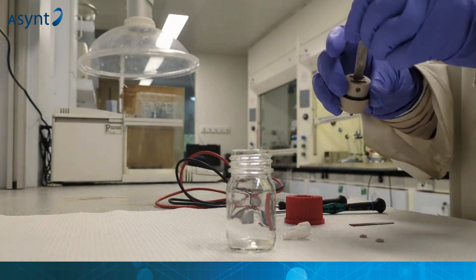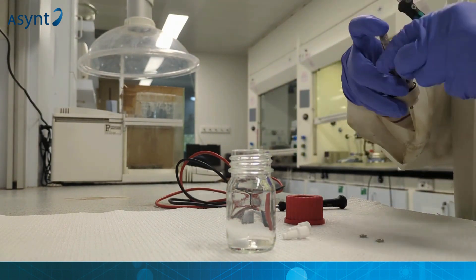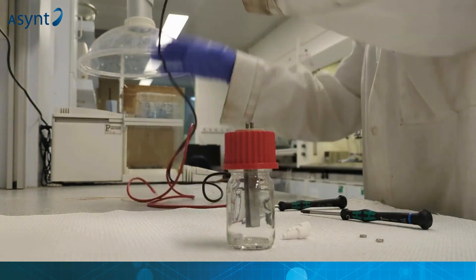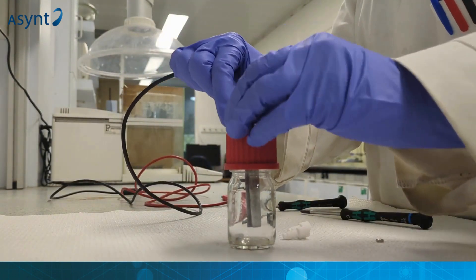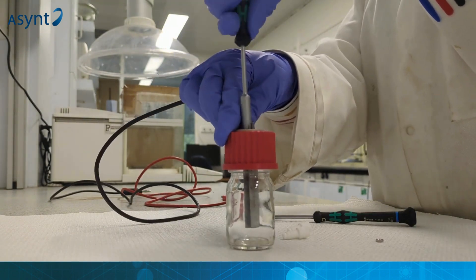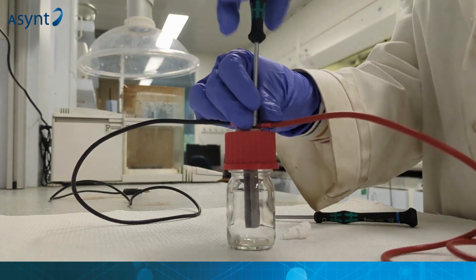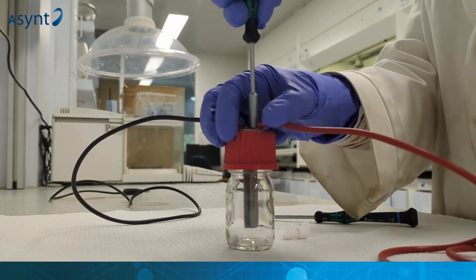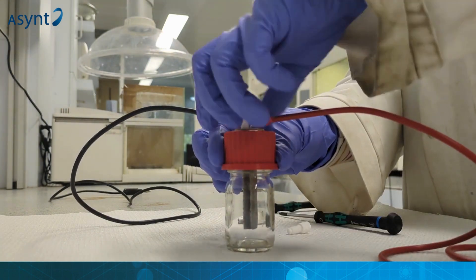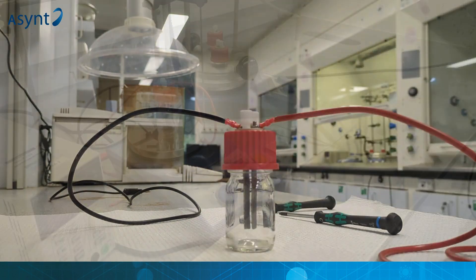Here you can see Dr Charlotte Wellens, the synthetic inorganic chemist who was involved in this project from the beginning, demonstrating just how simple it is to set up each of the individual cells that can be used in up to six positions within the ElectroReact base. You can set up these using any manner of electrodes and use as many or as few cells as is appropriate for your reaction.